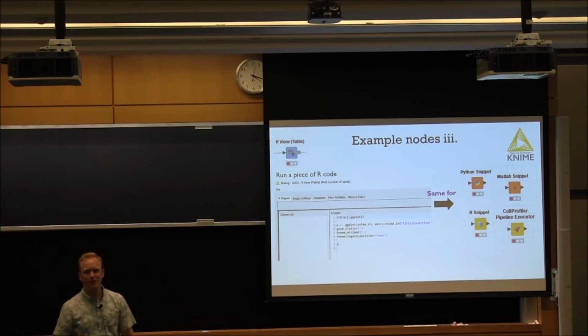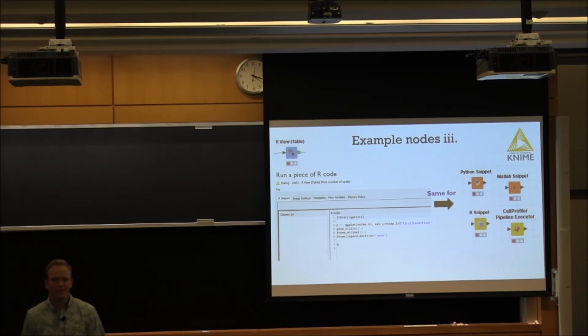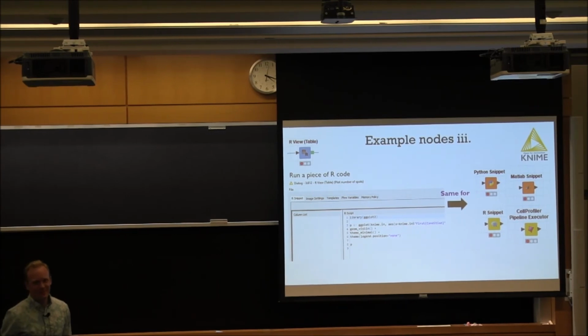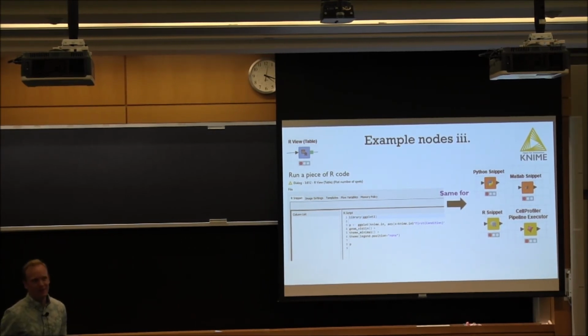Is there a way to go the other way around? For example, if I wanted to use the cell clump splitter in a script that I call from Python, to basically call the KNIME cell clump splitter process. In that case, I think that cell clump splitter is in scikit anyway, so I would just go to scikit and grab it from there. You're already too advanced. Yeah, sure. I don't see it being a useful way to really call KNIME. I think it's rather to use that as the base and then call other stuff.